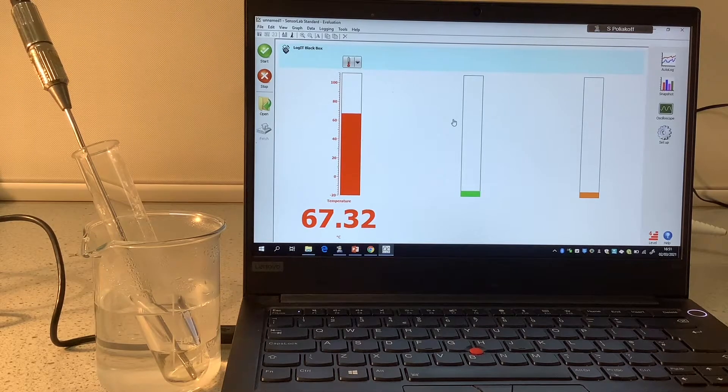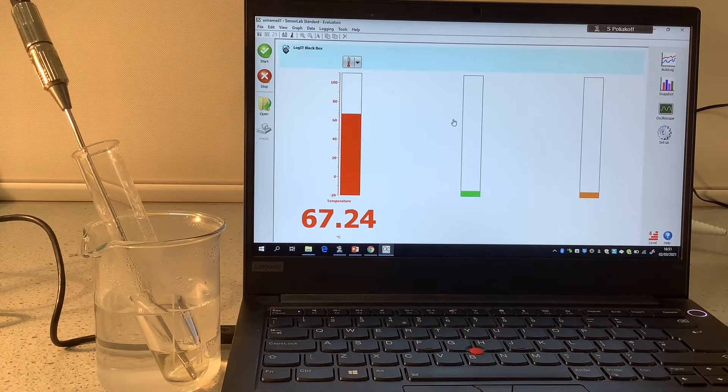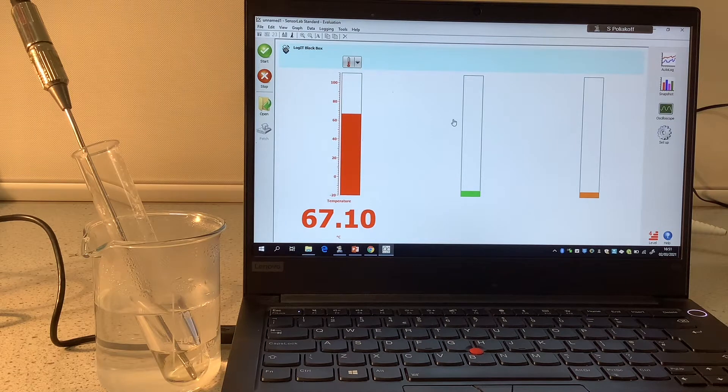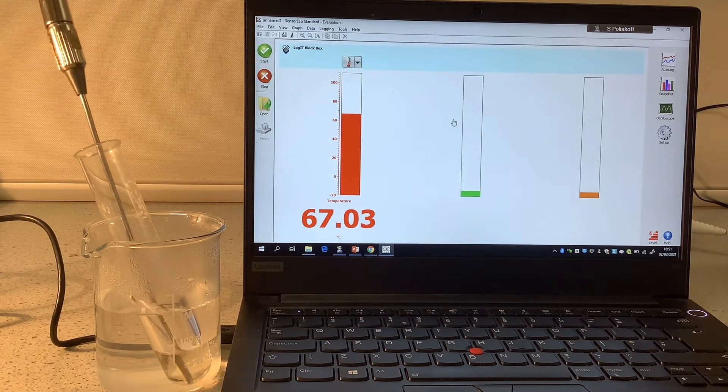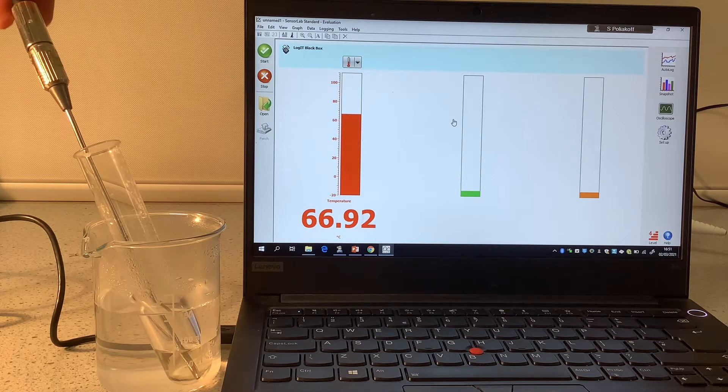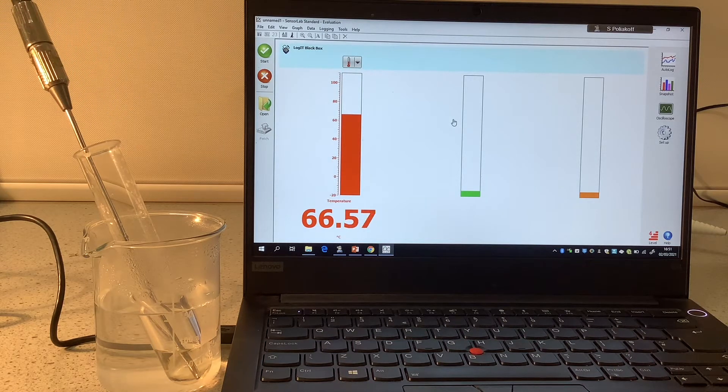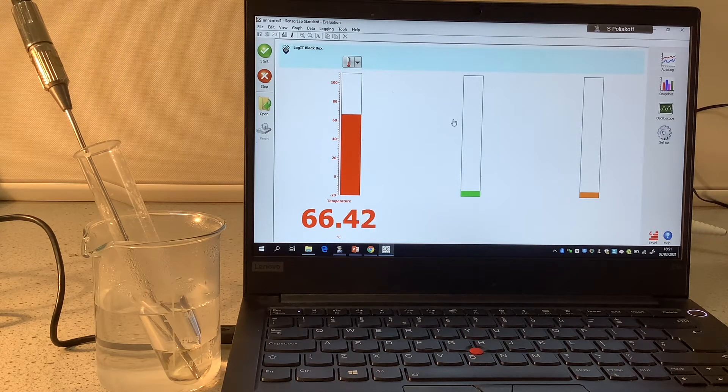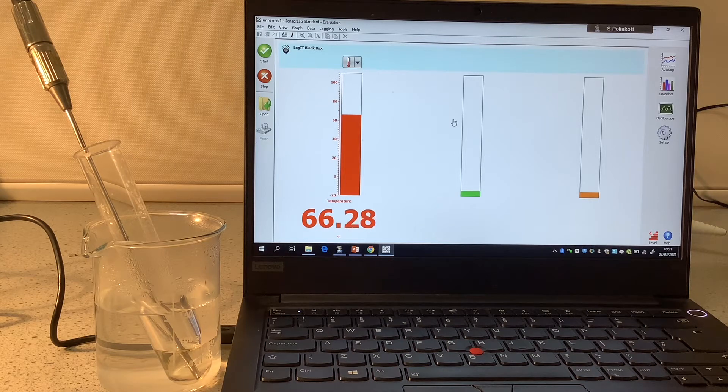In this video I'm going to try and create a cooling curve for stearic acid. At the moment I've got a boiling tube with stearic acid connected to this temperature probe and that's in some quite hot water, so it's at around 66 degrees at the moment.